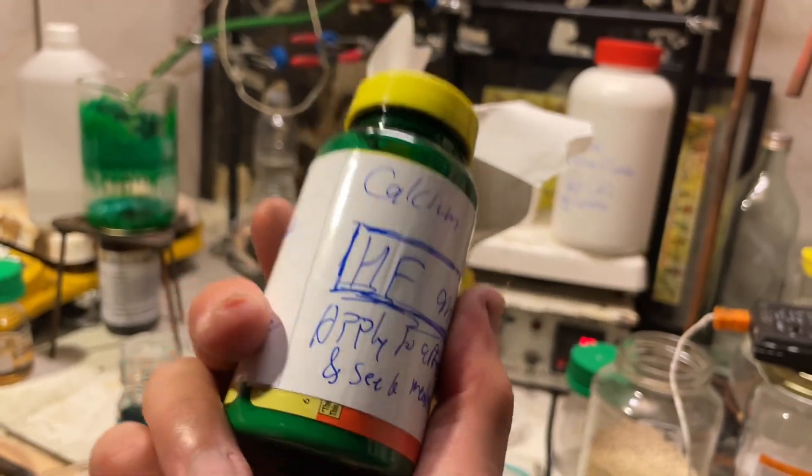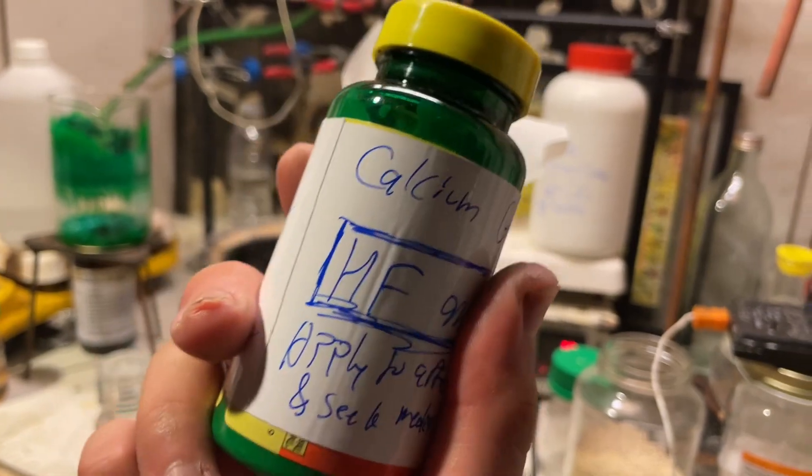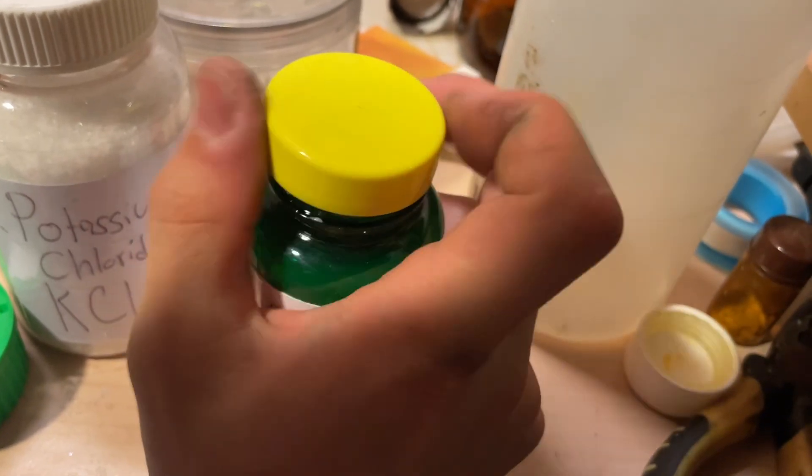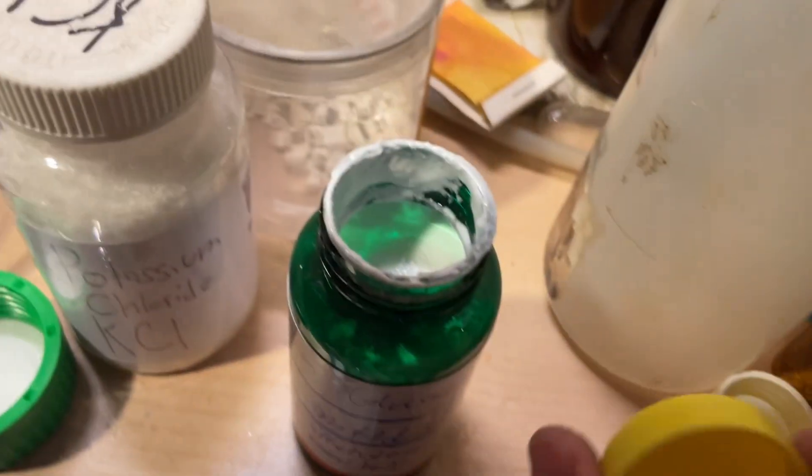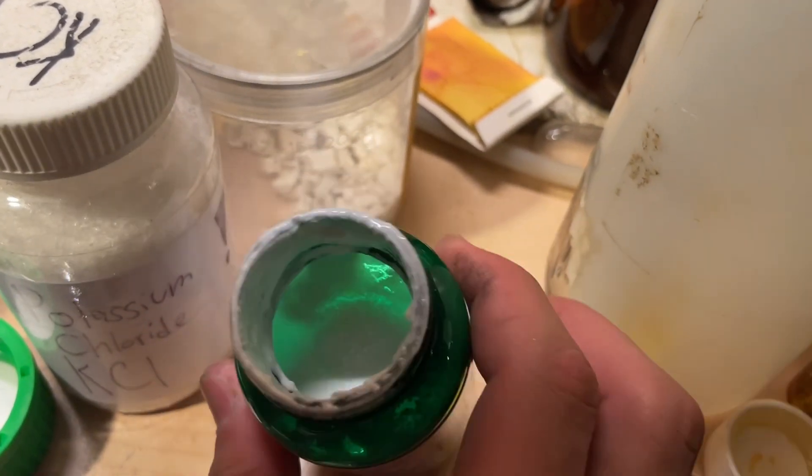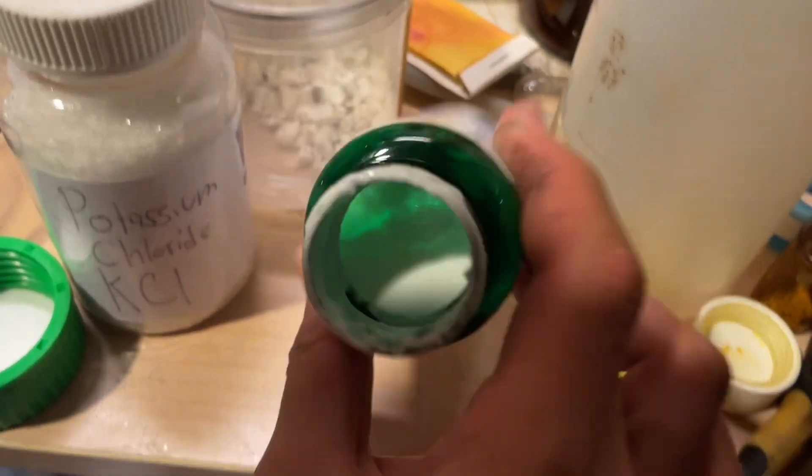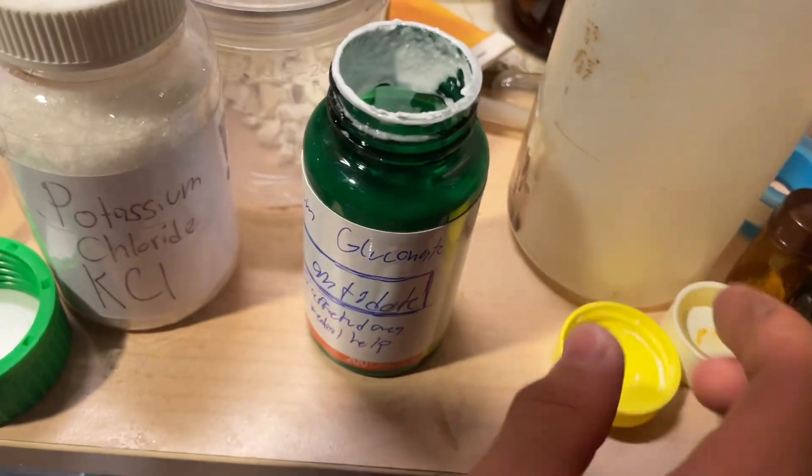So what I did is I just added approximately a 75 to 25 mixture by volume of calcium gluconate powder and water. Stirred it. There you go. There's a cream or a gel or a paste. It'll work.